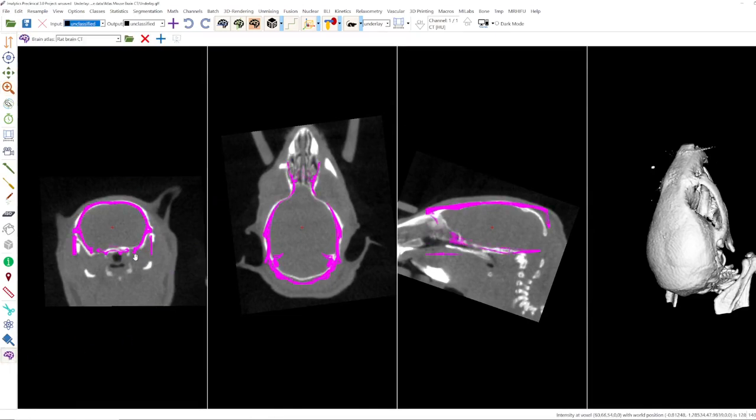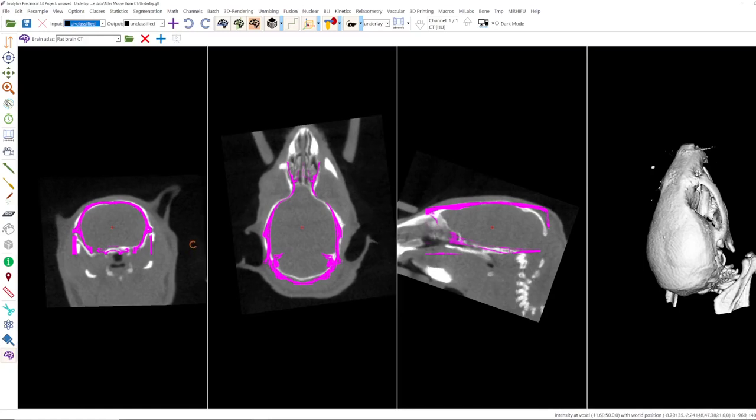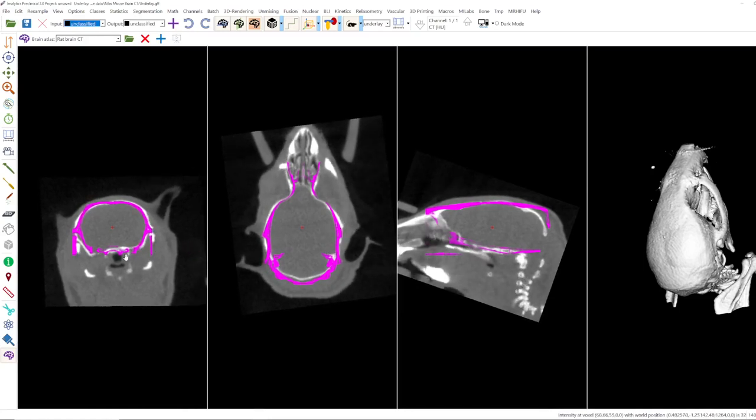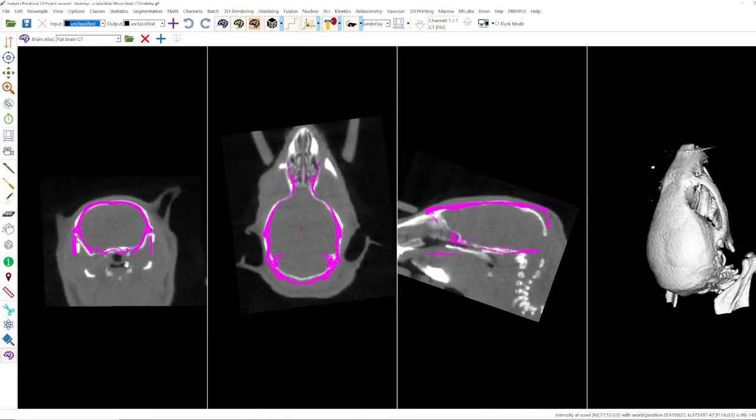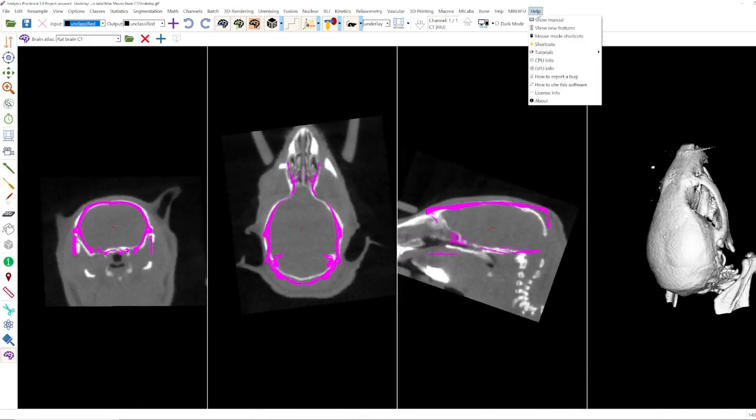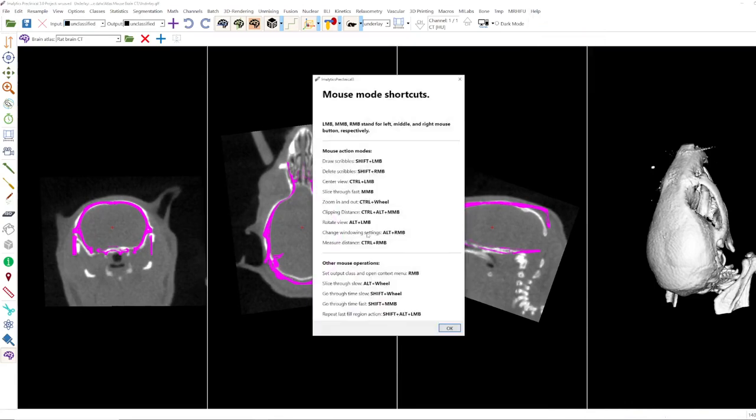For example for rotating you can use Alt and the left mouse button, for zooming it's Control and the middle mouse button. You can find these shortcuts here under mouse mode shortcuts. Here they are explained, the zooming and the rotating.